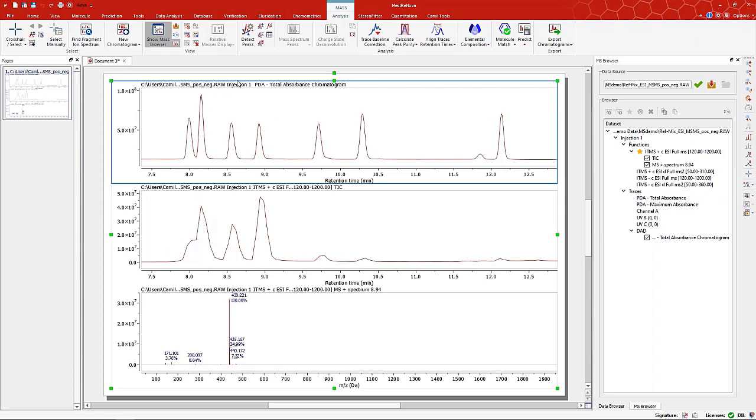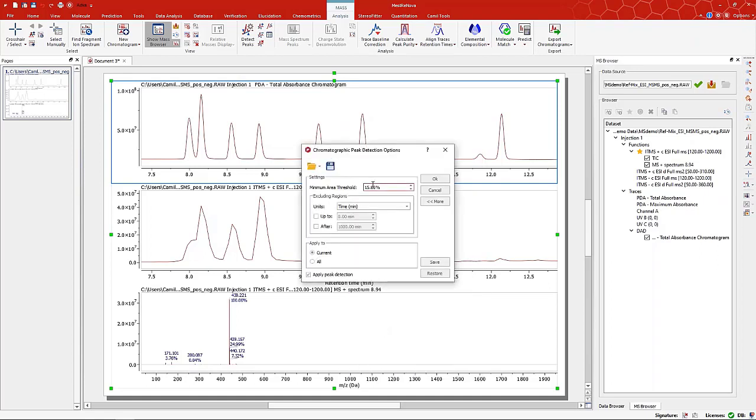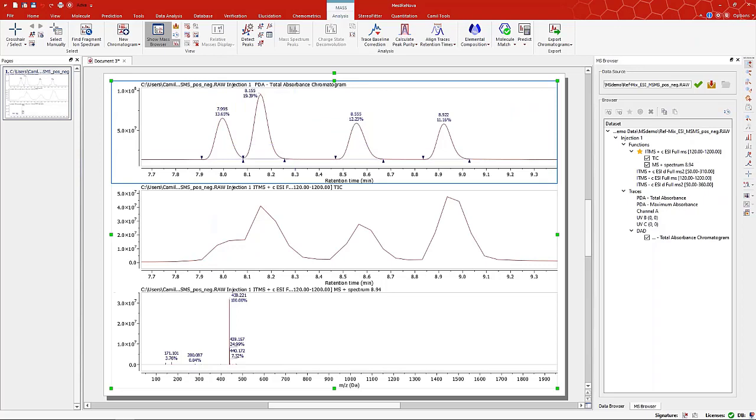The other thing you can do is, let's say I'll go back to just automated integration. Let's just go back to 2%. If I wanted to, I'm going to expand this region. If I wanted to change the width of the integration manually, I could do that by just dragging. If I just hold the wedge, I could drag it this way, drag it that way. Obviously, that's not a good way to integrate.